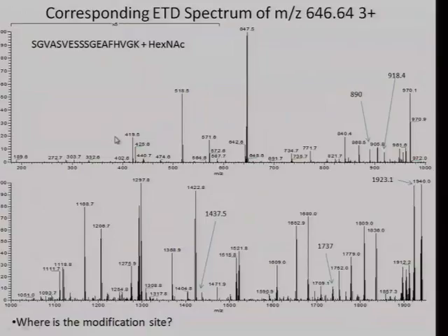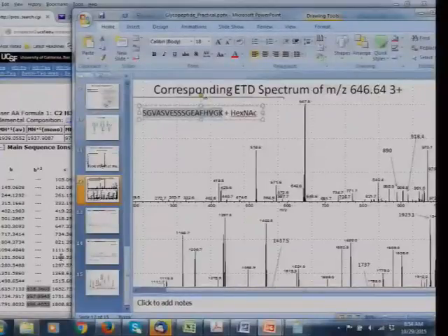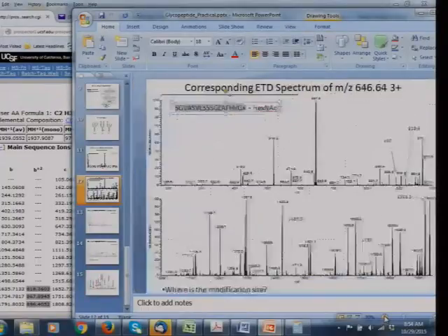Let's see if we see any other fragment ions that confirm that. The next peak we would expect would be an 1168. There it is. Smaller. Is that legible?